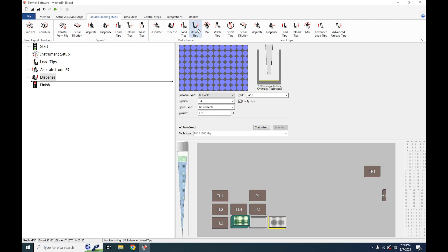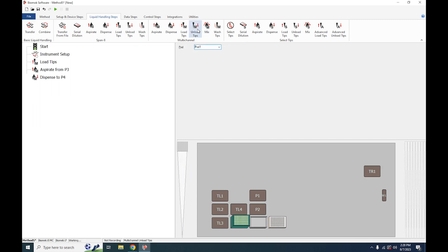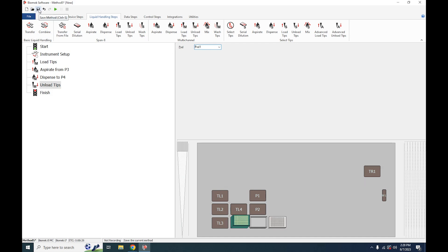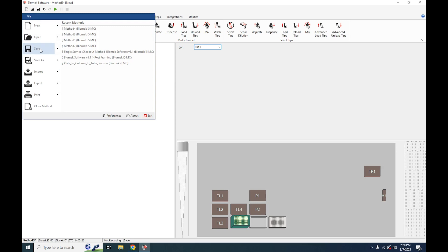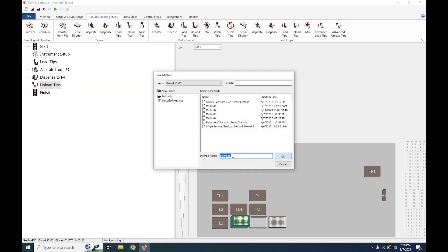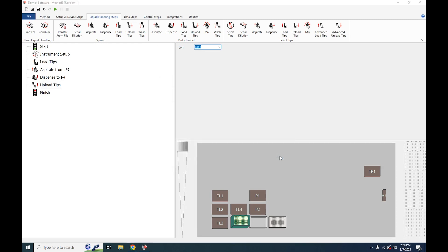Lastly we want to unload our tips back into the tip box. So click on Unload Tips or drag this into position. And now we're ready to save our method. Go to the top left, hit File or the floppy disk icon. Save your method as whatever you'd like to name it, hit OK, and now we're ready to run.